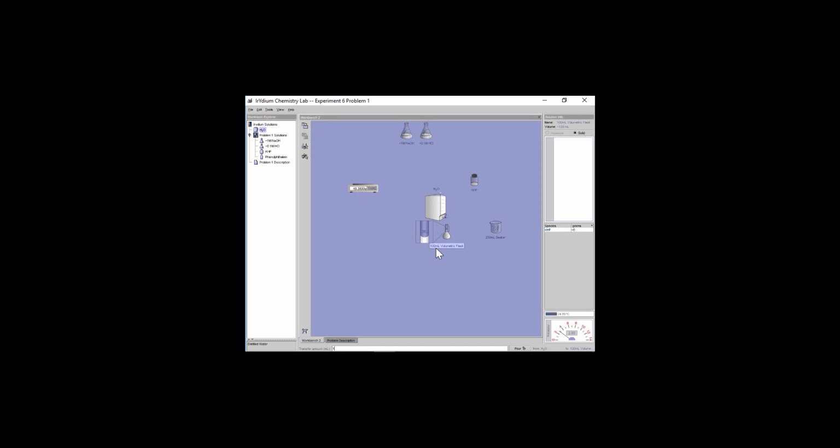Let's just take a look here. So I'm going to add in, maybe with a dropper pipette, maybe 0.5 mL if I can. I'm going to try to get it as close as I can so that when the bottom of the meniscus hits that 100, I know this is exactly the concentration that I wanted. If you happen to overdo it, even though the KHP was a very pure solid, I wouldn't be able to really measure accurately what extra volume you added. You can't take out that water again. You would actually need to redo this dilution procedure. So definitely be really, really precise towards the end so that the bottom of the meniscus actually lines up with 100.